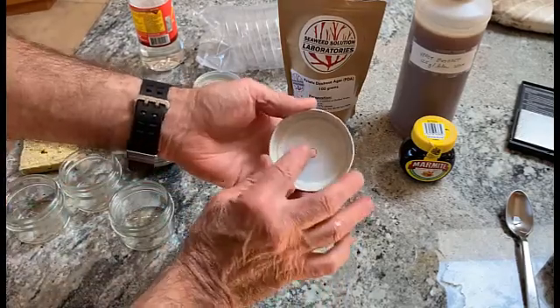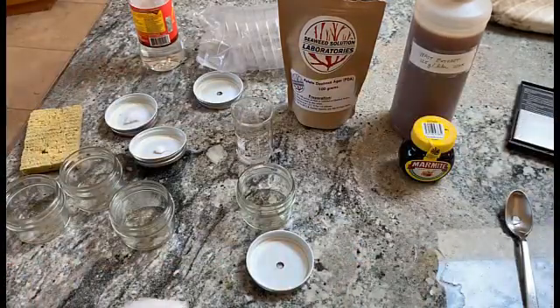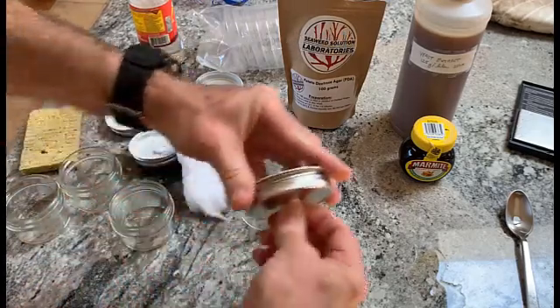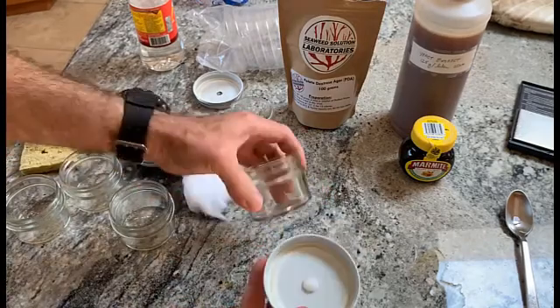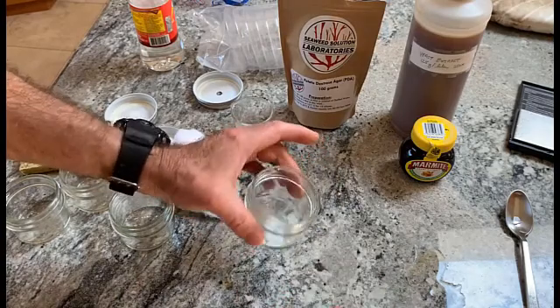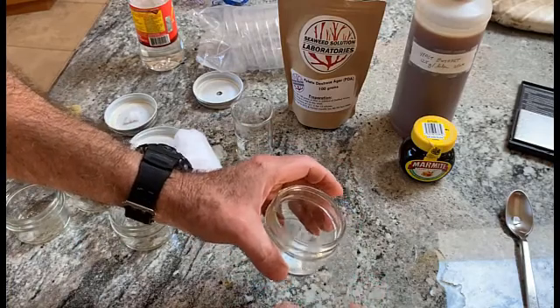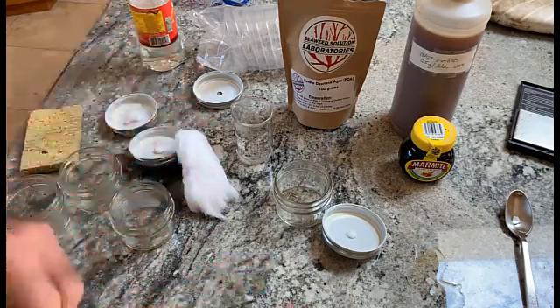I drill a hole, looks like about five-sixteenths — doesn't matter — and I use cotton batting and stuff the hole with cotton. We fill that with the agar and then pressure cook it so everything is fully sterilized. The cotton is a barrier to the entry of contaminants, so once we sterilize the inside it'll stay sterile for months or perhaps years, so we never have to worry about it.